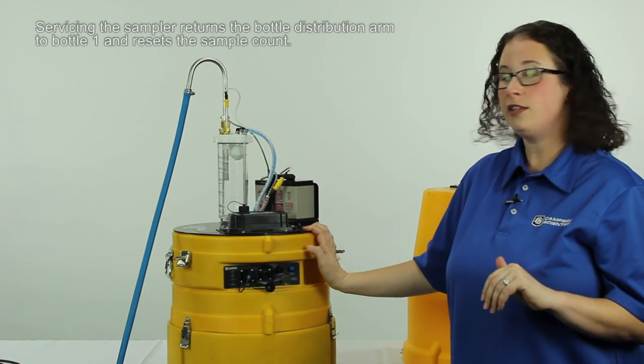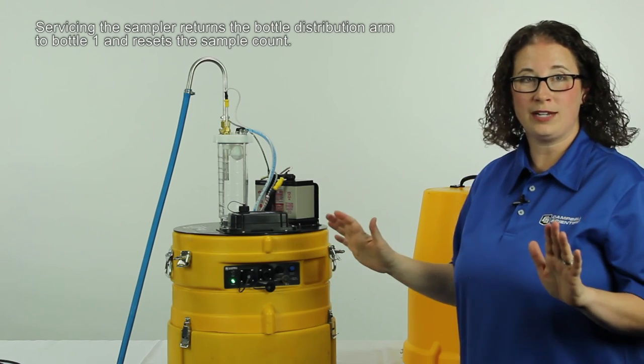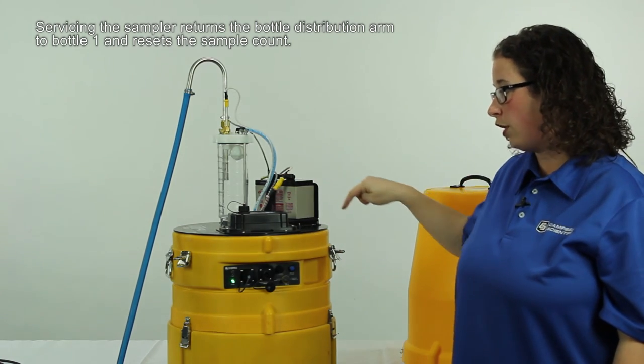You tell the sampler it's empty, go back to spot one, and you'll hear your arm move all the way back around to the home position at bottle one.